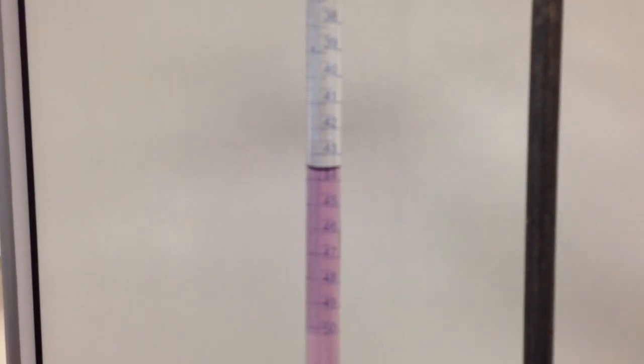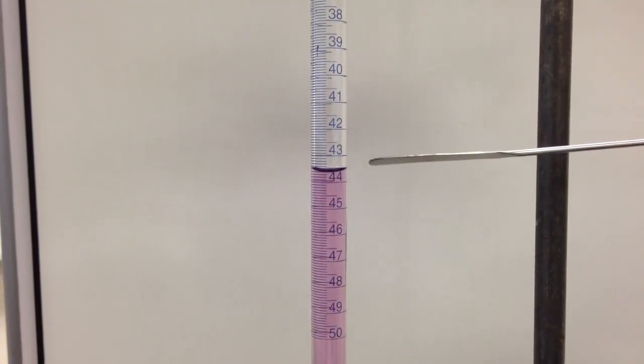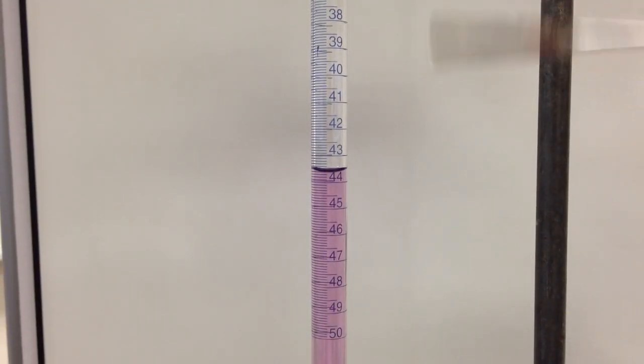burettes are read by reading the empty space above the liquid. So here we have our 1 milliliter increment: 43 to 44, 45.